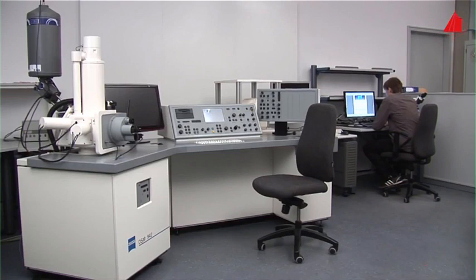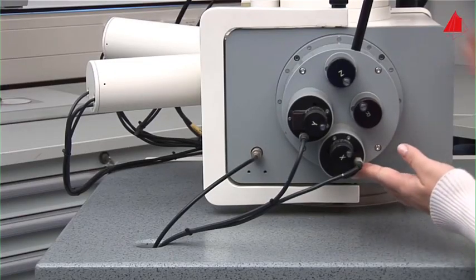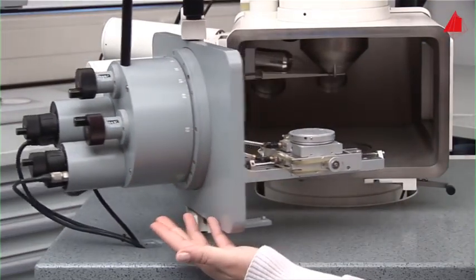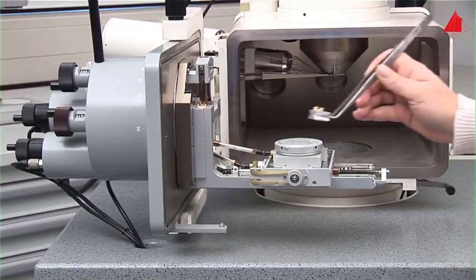Components of the microscope are column for electron beam generation, specimen chamber, vacuum pump, monitor, and control panels. She can open the cover plate of the specimen chamber. Together with the cover plate, the stage pans forward. Now different specimens can easily be placed on the round stage.